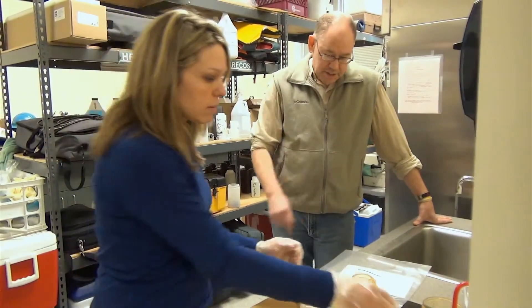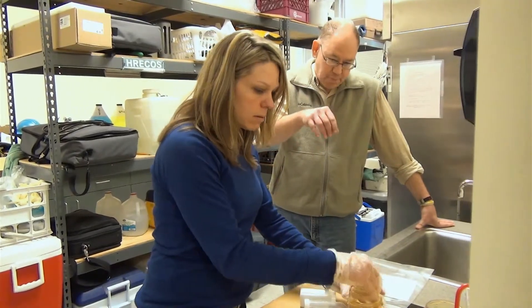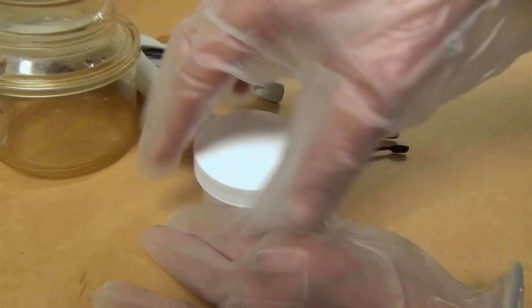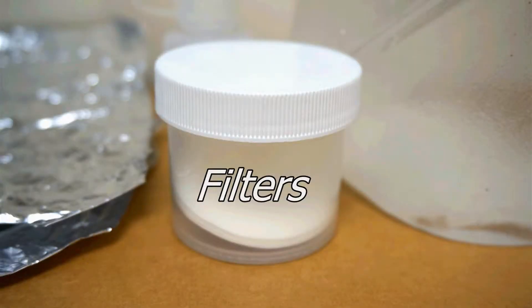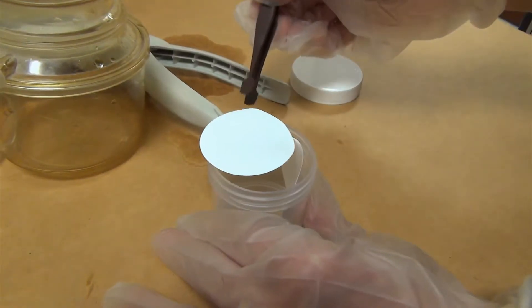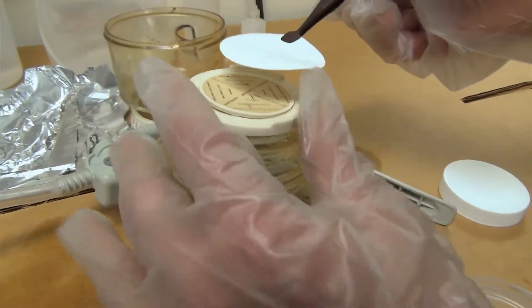Take the center piece and place it back on top of the receiving flask — you'll actually hear it snap on. Then take a filter from the small cup that has individual filters separated. Using forceps — what everyone else calls tweezers — grab a single filter and place it right on top of the center piece.